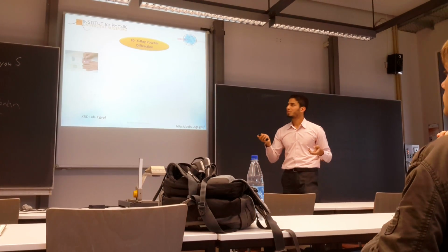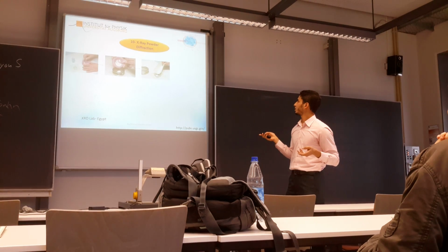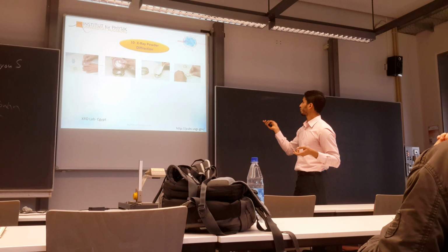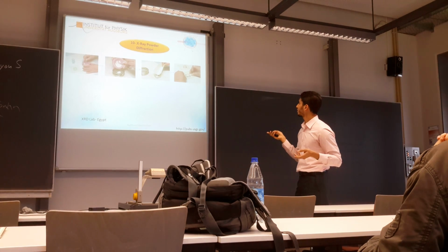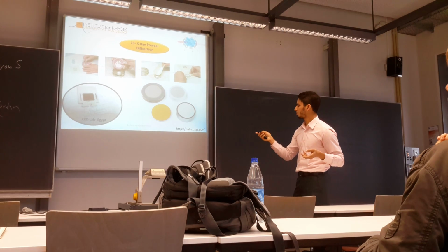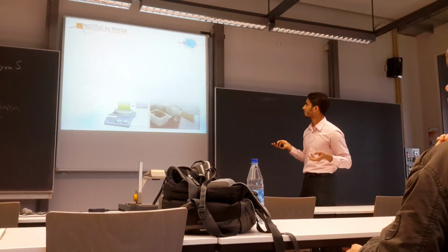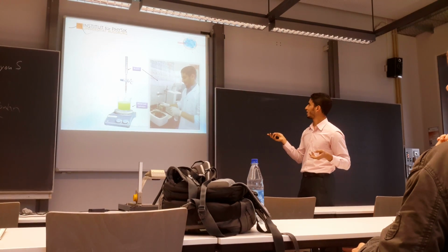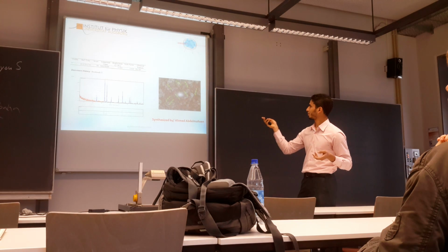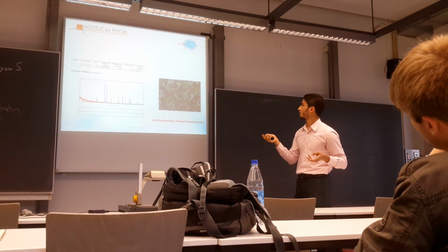X-ray powder diffraction. First of all, you should grind your sample well. Then you add your sample in the sample holder here, and you should adjust the surface by using a glass sheet. There are different types of sample holder, and that I used in Egypt for preparation of samples for X-ray measurement. I prepared some nanomaterial in Egypt before coming and did characterization, and we can see some nanomaterial. So I am showing this to illustrate this point here.